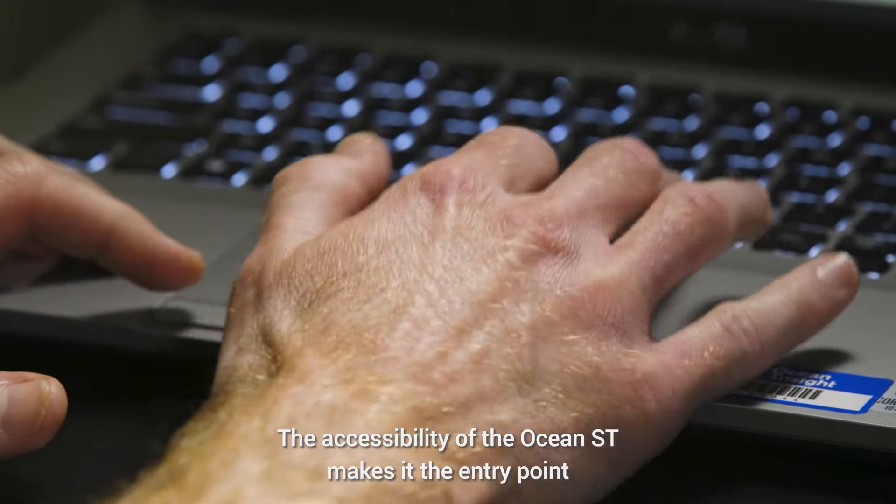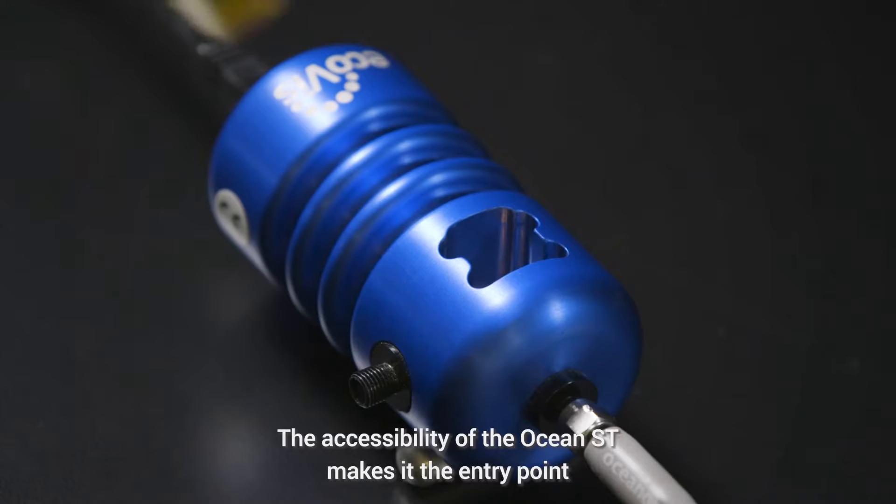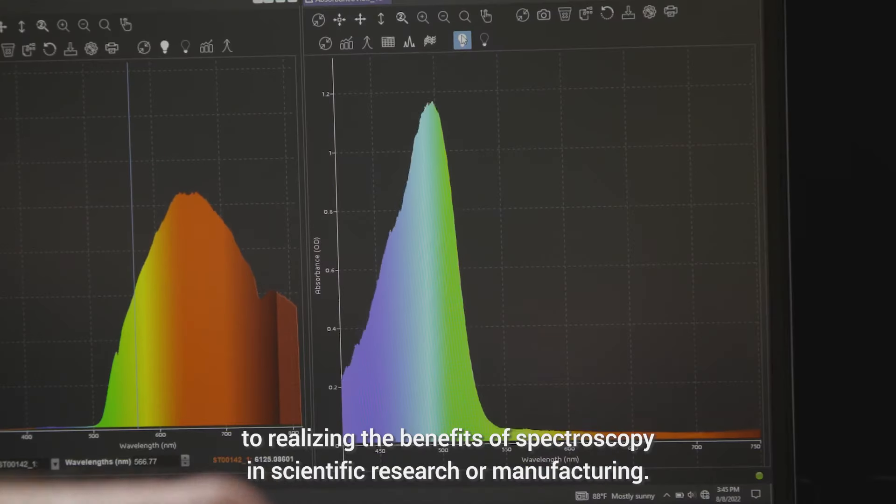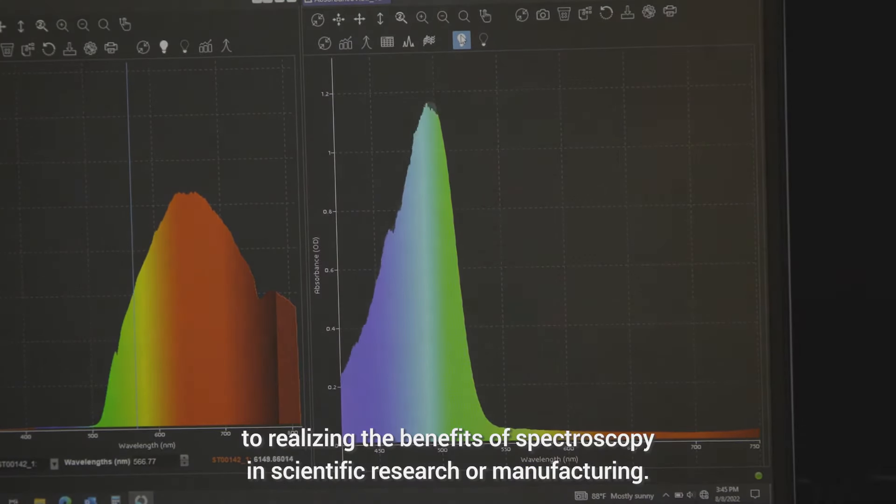The accessibility of the OceanST makes it the entry point to realizing the benefits of spectroscopy in scientific research or manufacturing.